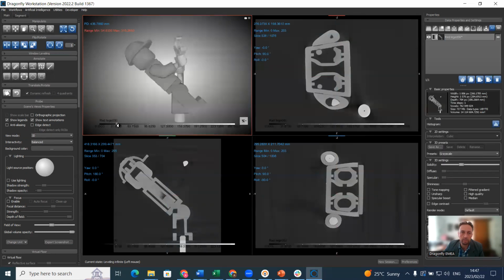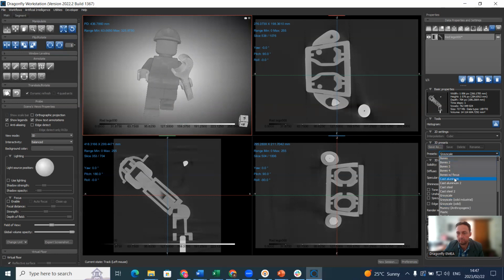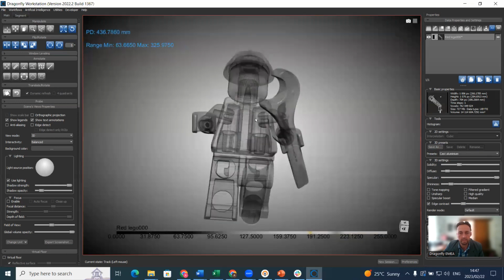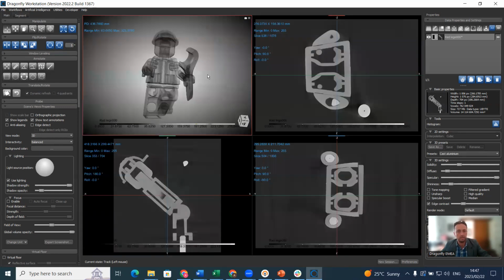What you will see with a quick shortcut render is you have a Lego man loaded on a stick into the CT machine, and it's holding a spanner, and we can make a nicer rendering of that. If you like, you can optimize that in this. Actually, what I can show you, which looks quite nice, is to make the Lego man transparent. And this will be sensible, because we will make segmentations of different regions, make different ROIs, which we can directly see the segmentation on top of the transparent Lego man while we are doing it.